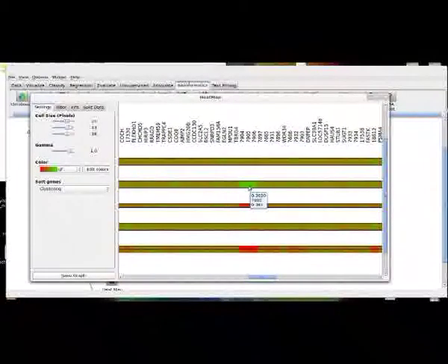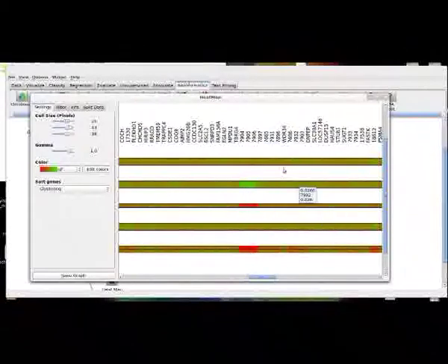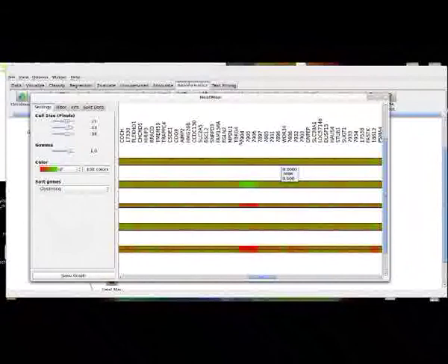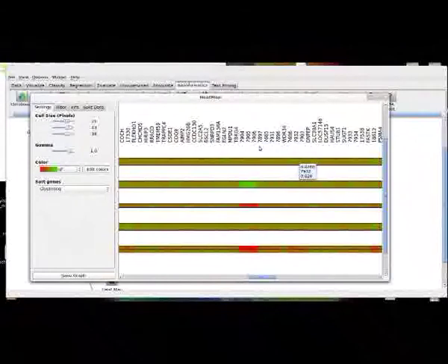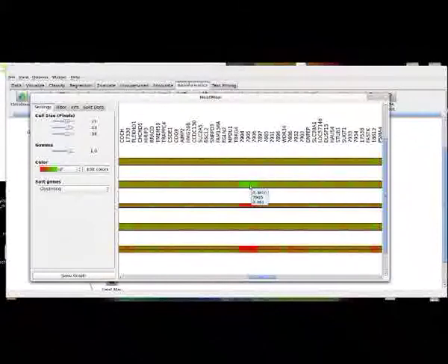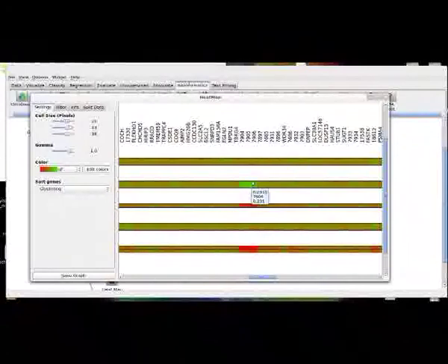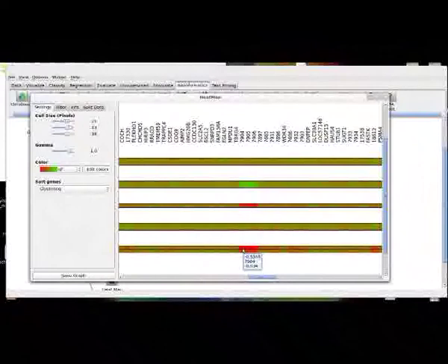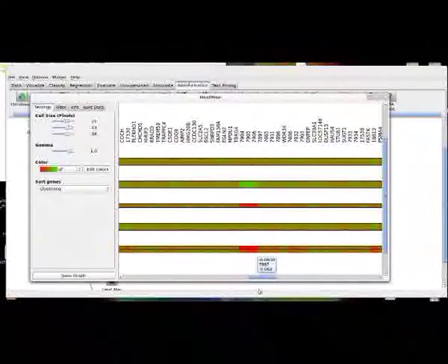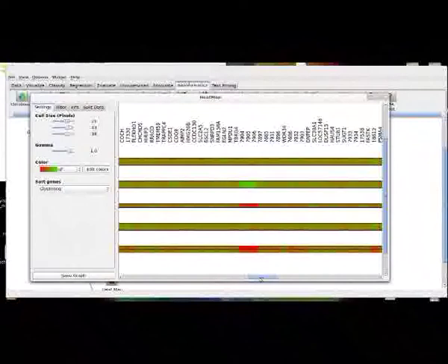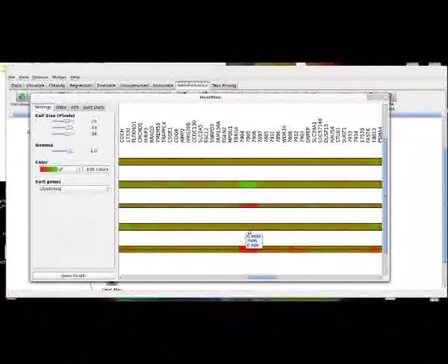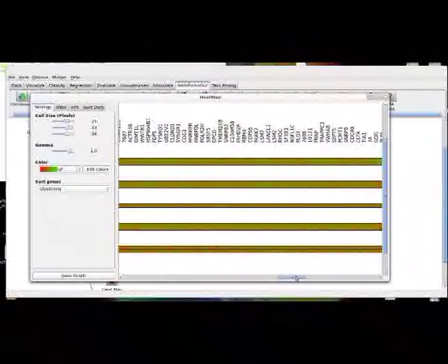I've clustered this. Ah, here's a great example. So we have one type of tissue here and two different types of tissues here, and we can see that there is a very, very large difference across these three different genes, 7904, 7905, and 7906. Funny enough that their name should be so similar. And we can see that in this tissue type that we have much higher expression. In these two tissue types, we have very, very low expression. So in trying to determine the genetic reasons for why these tissues are differentiated from each other, we might want to examine those two genes, at least in relation to those two tissues, because these other tissues don't seem to be as defined in relation to those genes.